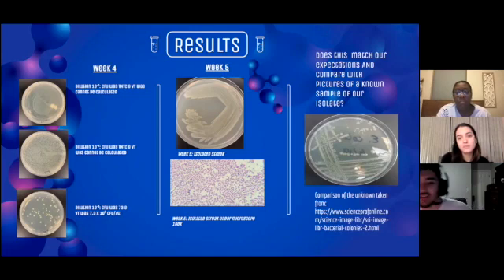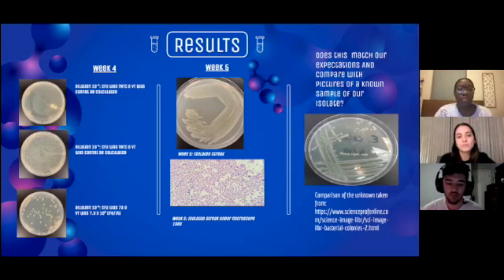In week 5, we also see that the colonies had similar morphology to the week 4 ones. And when magnified under the microscope at 100 times, this is where we came to the conclusion that we had gram-negative rods as well. And lastly, here on the right, this picture shows if our expectations were matched with our unknown sample, and spoilers, but yes, it was.